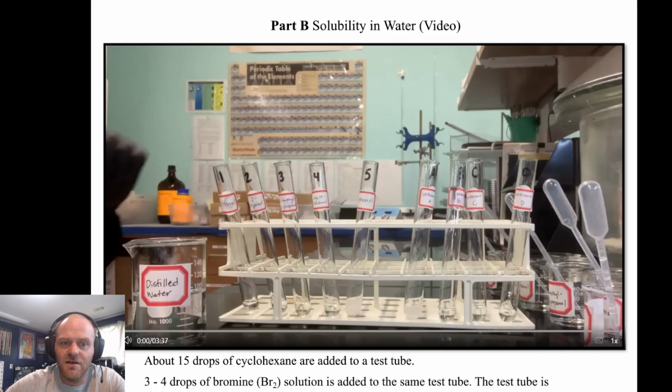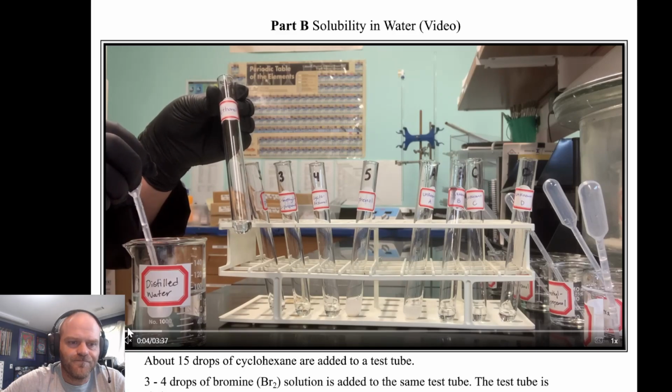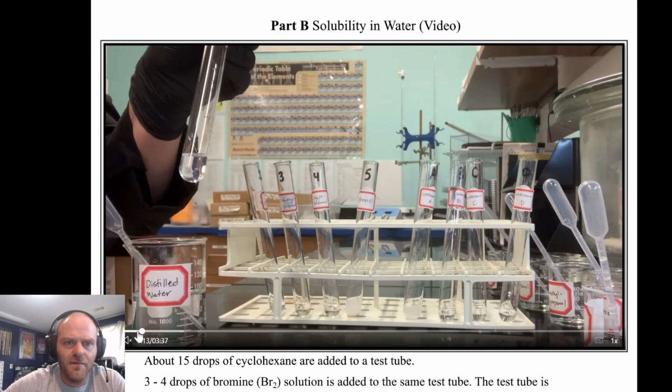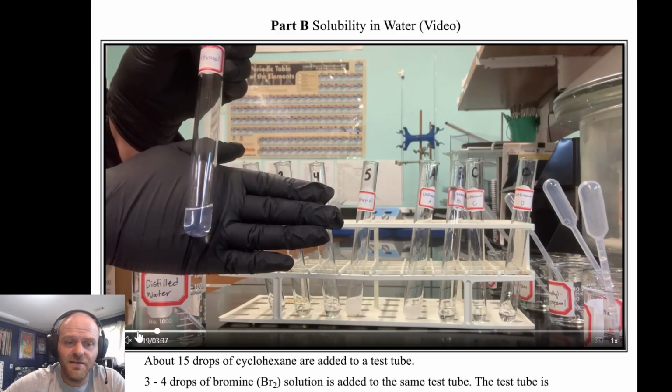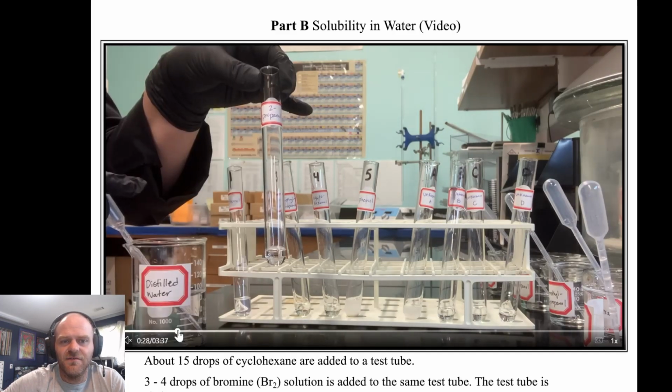And now here is solubility. All right, I'm going to let this play out. It's kind of hard to see these once she's mixed them up, but you will notice an obvious difference in the ones that are non-soluble from the ones that are. Okay, so I'm going to let this play through, and I might just skip to, okay, so yeah, I don't see anything obviously different about any part of that. So we'll say that one is soluble, and that's going to be all the help that I give you from here.